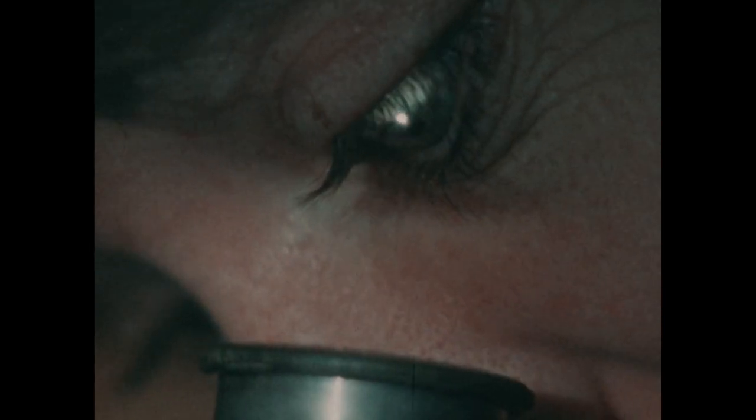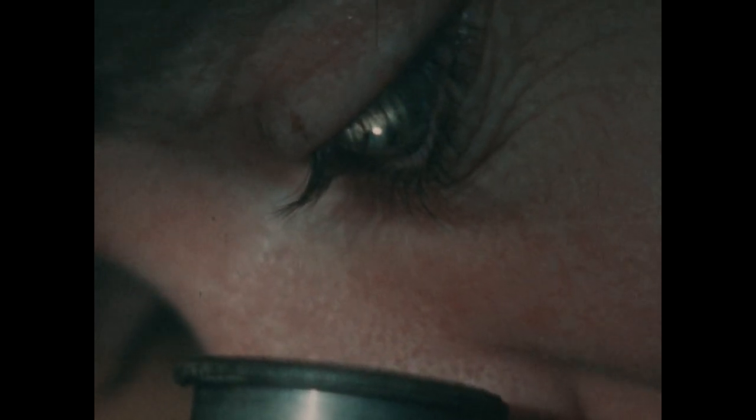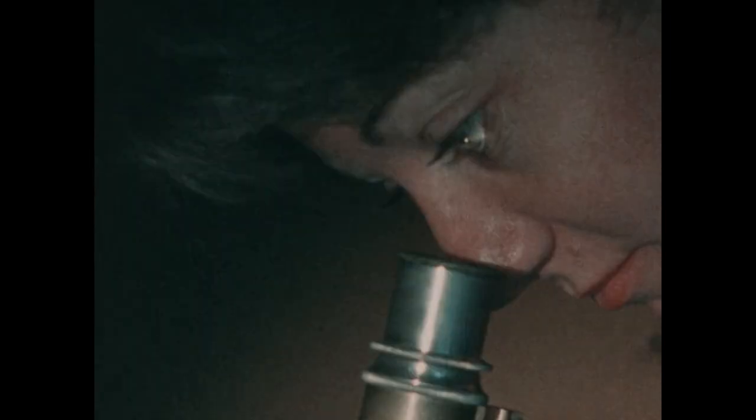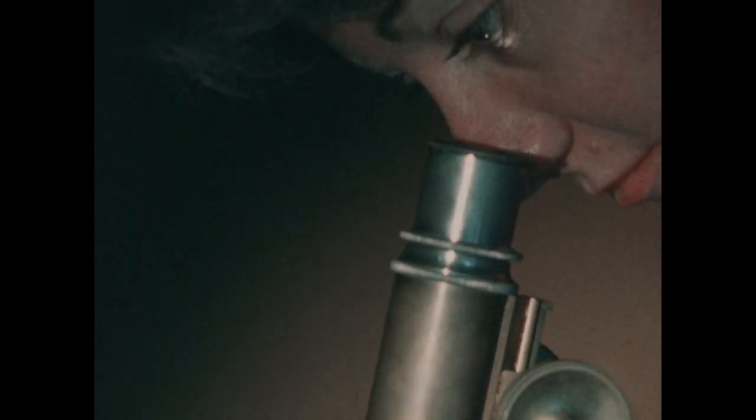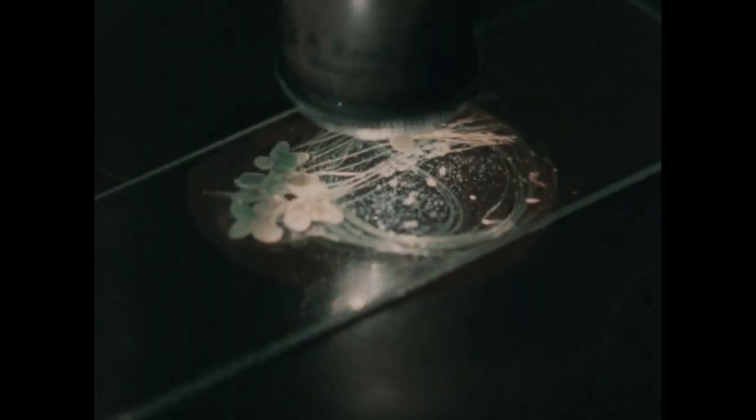The unaided eye is a powerful observational tool. But in 300 years since the invention of the microscope, we have learned of a world hidden within the very things that appear ordinary to our naked eyes. Pond water becomes, under the microscope, a teeming mass of microorganisms.